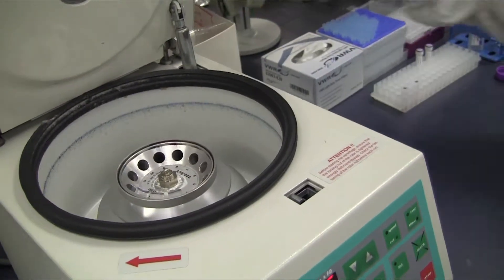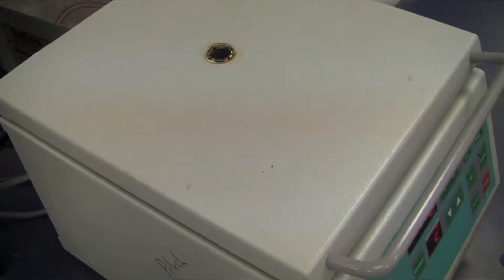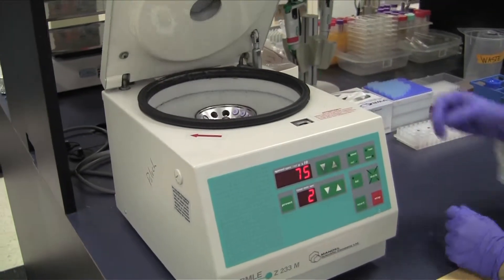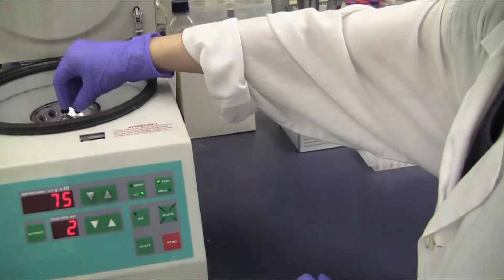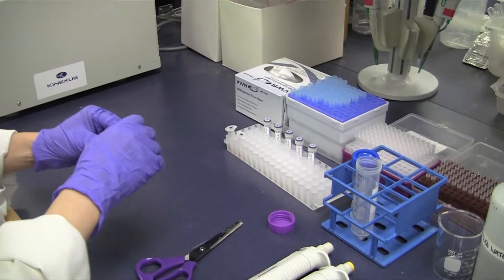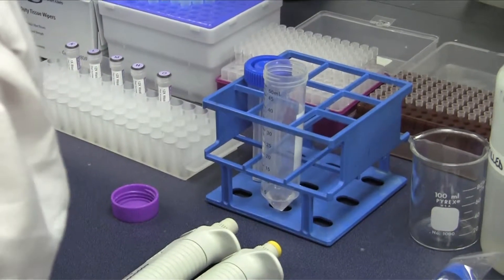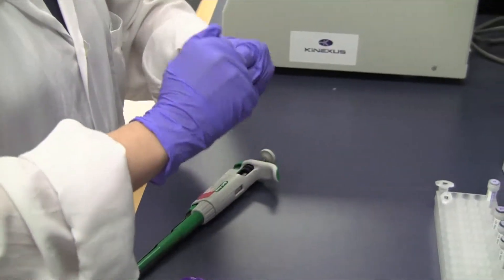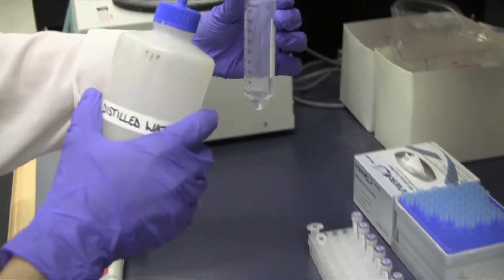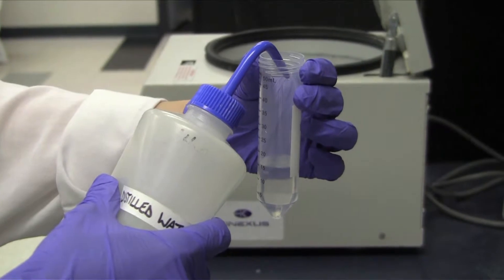Quickspin the 10x blocking buffer 1 vial part CAM-J and the blocking buffer 2 vial CAM-K in the microcentrifuge. Transfer all the liquid from the 10x blocking buffer 1 part CAM-J into a 50ml conical tube with a pipette, and then transfer the blocking buffer 2 part CAM-K into the same 50ml conical tube. Adjust the final volume with water to make up to 20ml, then mix by inverting the tube several times before pouring it into the microarray slide container.